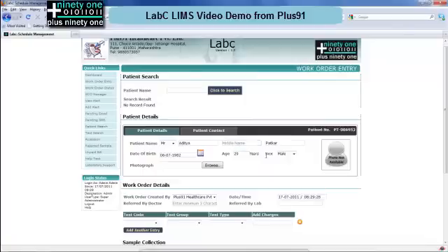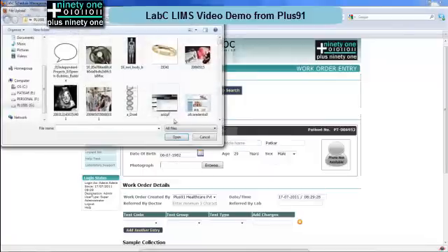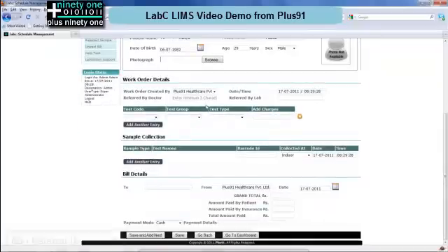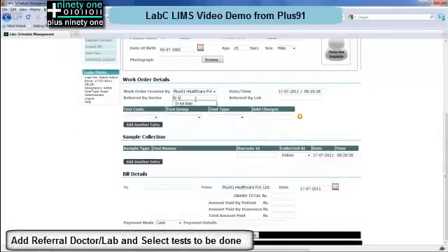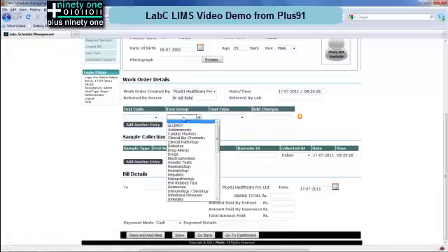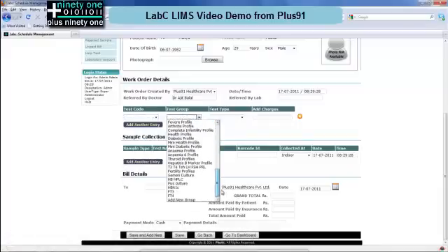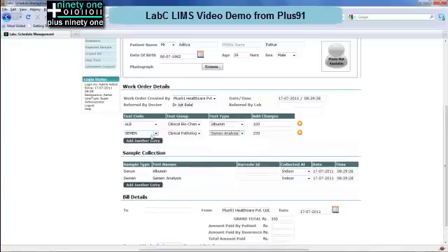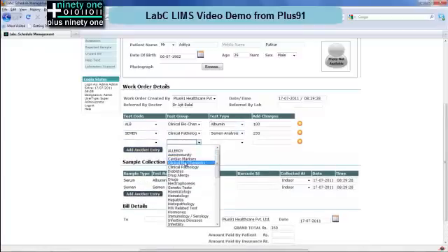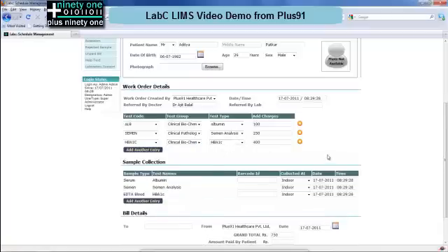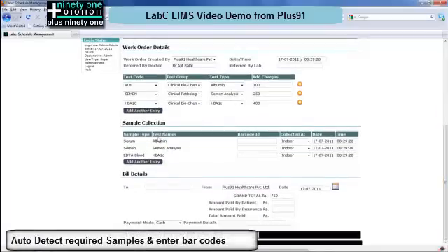Here we can see the entry of a work order on a single screen. You can attach images of the patient, add a referring doctor which is an auto-complete option, and a referring lab. You can select the tests — the tests have their test codes and are organized into various test groups as well as the actual test. Here you can select multiple tests, and automatically at the bottom the various samples required for those tests are shown.